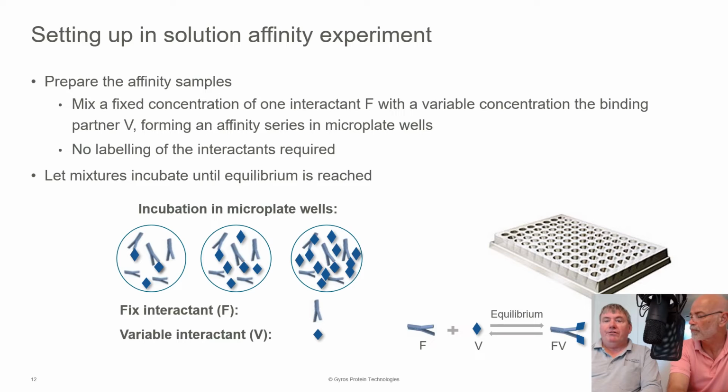Yeah, and another good example is you can do your affinity samples and run them after say 2 hours, and then you can also leave the samples to incubate overnight. Yeah. And then you can see if there's any shift, and if it hasn't reached equilibrium, then you know you have to incubate for longer. Yeah, you'll see a shift over time; we've done experiments with very high affinity interactants that go up to 3 days. Again, that's something we'll have to optimize as you move forward, but certainly could be done in a screening mode at a shorter incubation time.